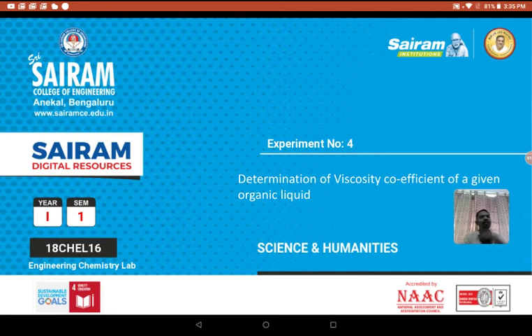So now allow the liquid to flow. Each and every liquid wants to come out first out of the container. When the liquid is coming out of the container, it comes out in the form of layers. So this is one layer, this is one layer. There will be friction between the layers, so due to the friction, the overall flow rate of the liquid will be reduced. Resistance will be offered to the flow rate, and that resistance offered to the rate of flow of liquid is called viscosity.